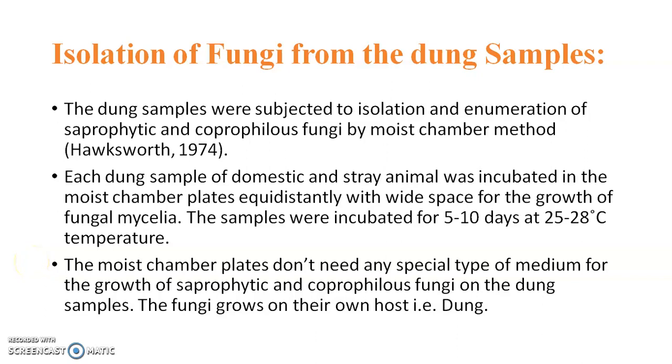The samples were incubated for 5 to 10 days at 25 to 28 degrees Celsius, that is room temperature. The moist chamber plates don't need any special type of medium for the growth of saprophytic and coprophilous fungi on the dung samples. The fungi grow on their own host, that is dung.